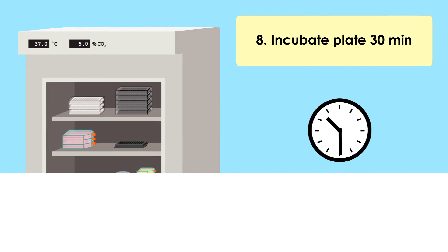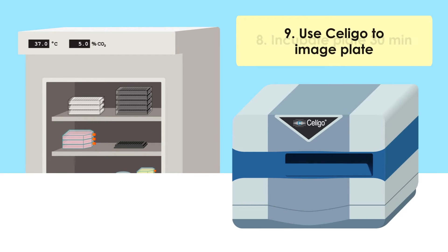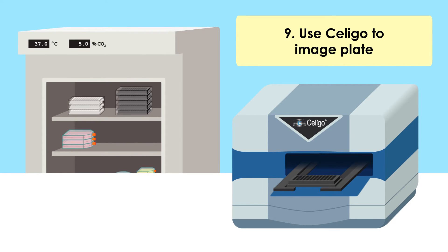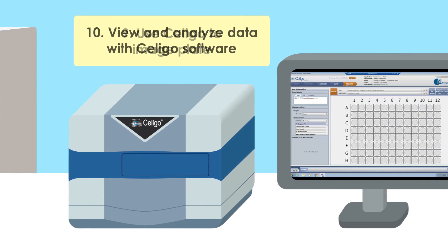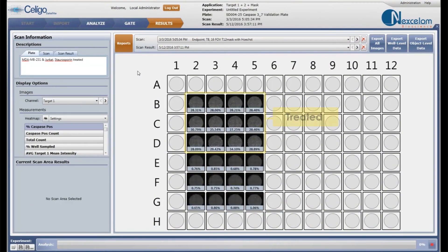Because the Celigo can image and analyze adherent cells, trypsinization is not required. Whole well imaging of 24 wells was captured in 3.5 minutes. The analyzed results are displayed in a plate-based format showing a thumbnail picture and percent of apoptotic cells for each analyzed well.